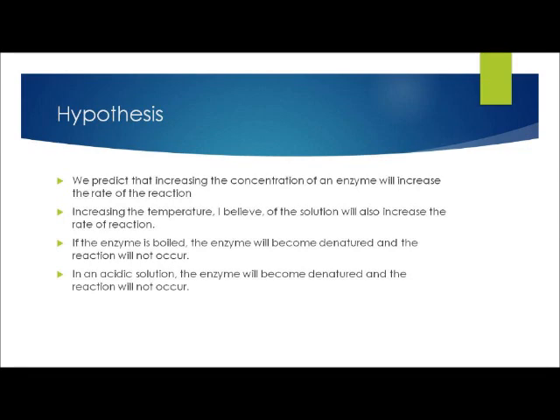Our hypothesis for this experiment is that we predict that increasing the concentration of the enzyme will increase the rate of the reaction. We also believe that increasing temperature will also increase the rate of the reaction. If the enzyme is boiled, the enzyme will become denatured and the reaction will not occur. And if the enzyme is put in an acidic solution, it will become denatured and the reaction will not occur.